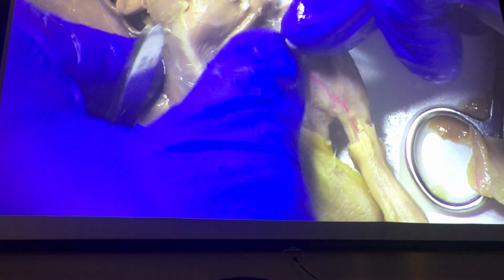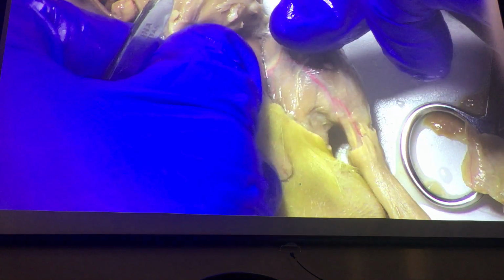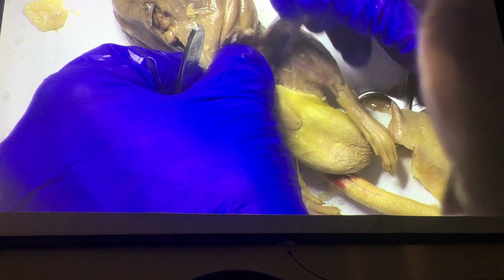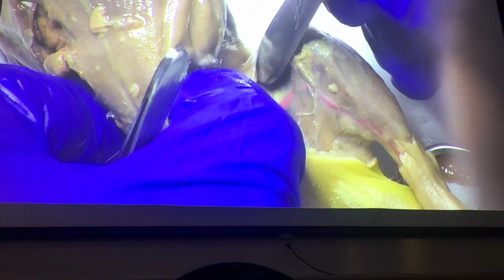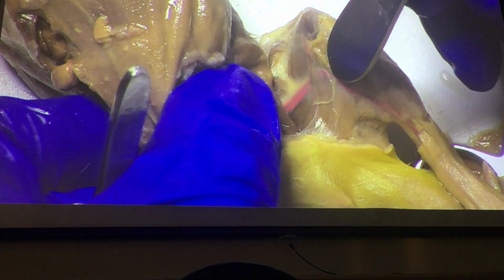And again, sometimes working in here, it's a little bit of a challenge. Everything's so tight in there. But really, some of this stuff you almost don't even need your scalpel for. You can come in here with the back end of the handle and push this apart a little bit more and help to begin breaking things apart. Until you get to a nice big chunk of fascia, then you can come in. But already we can begin to see some of our muscles showing off there.